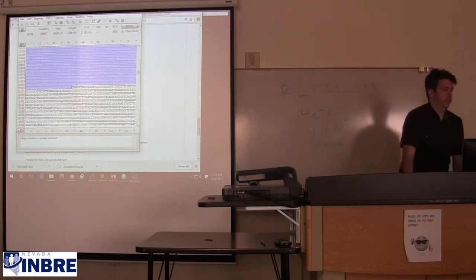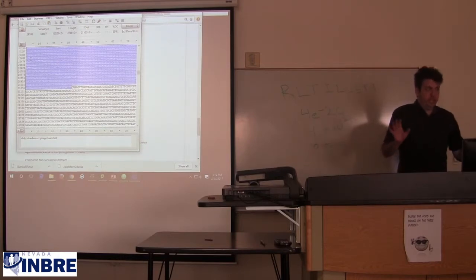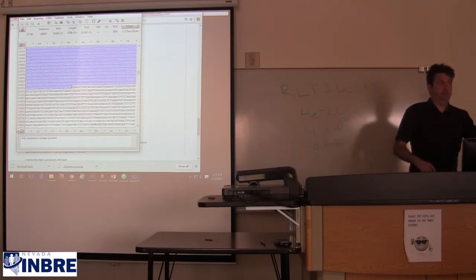And we'll see that in APE now it's highlighted just those regions, and we know that we got it right. If we were to do this in Notepad or attempt to do this in even Atom, how do we know whether we're counting the returns or not, or the definition line? We can't. There's a variability there that we can get away from by using something that's sequence focused, the way APE is.